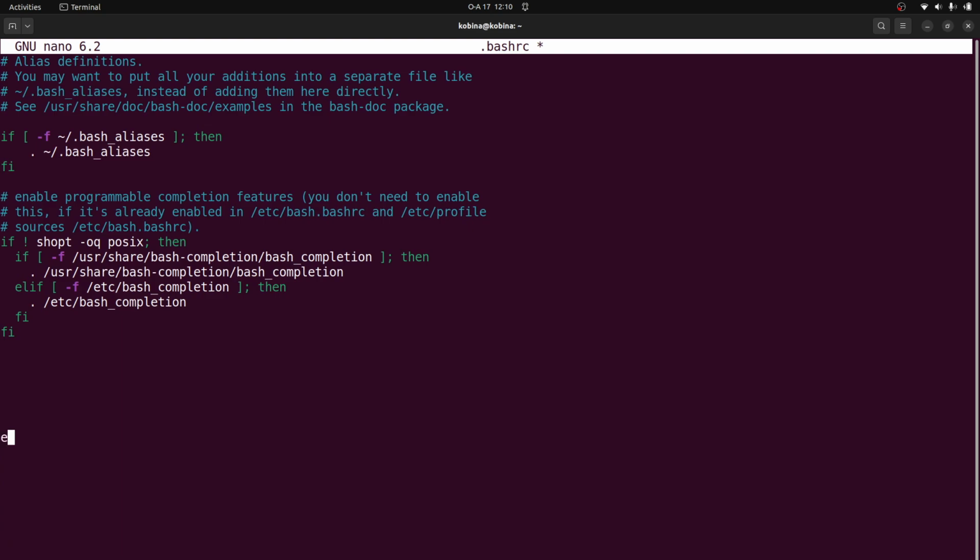So when I'm here, I'll say export PATH equals $PATH, and I'll bring it here. I'll paste that path. You can also bring it before $PATH. That's also fine. It depends on you. Whichever case is going to work. All right. I'm assuming that this is the only KronaTools installation you have. All right. So this is how it's going to be. So now we will exit and then save changes.